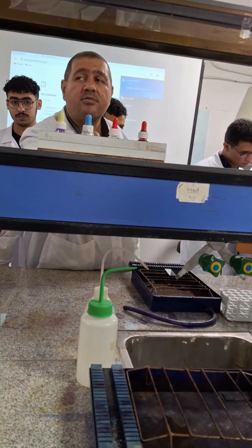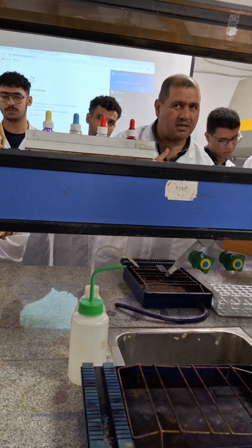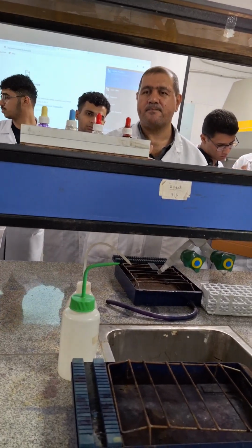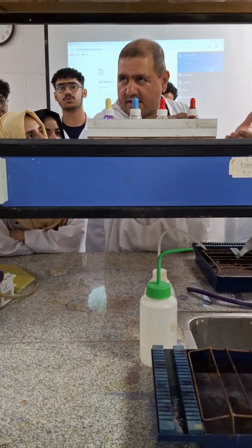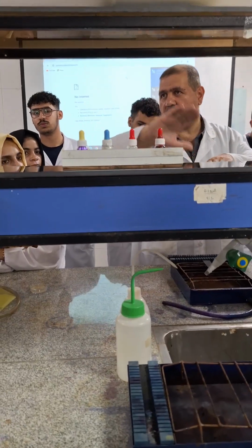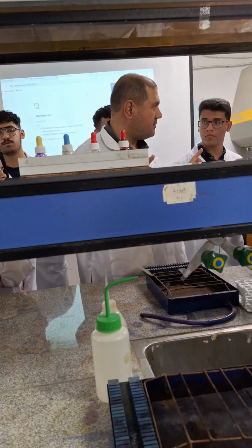But the outer membrane inhibits the penetration of crystal violet. So we need a second stain for gram negative after removing the outer membrane with alcohol. Do we understand?